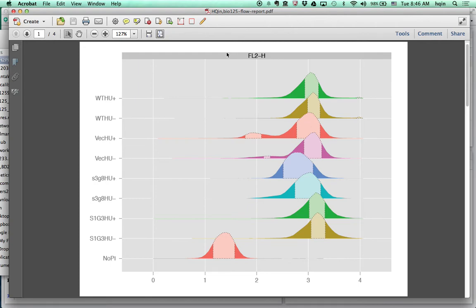Unfortunately, that's a bad experimental design on our side. But once I look at the flow cytometry data, I realize. But that tells you how we can use data analysis to find out how to interpret experimental data.